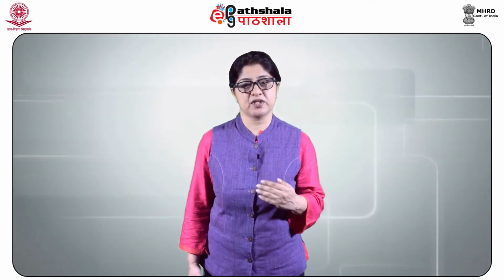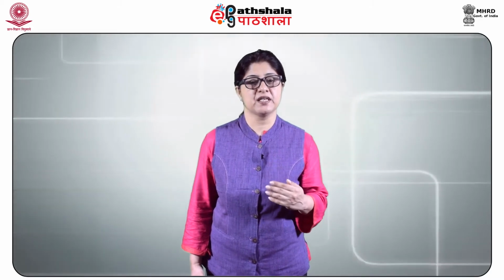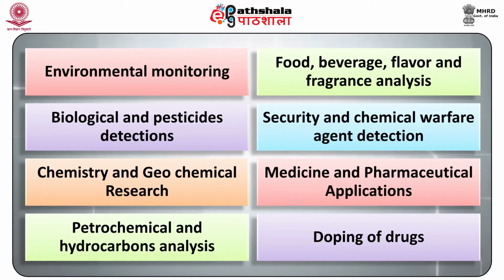It has established applications in various fields such as environmental monitoring, food, beverage, flavor and fragrance analysis, biological and pesticide detection, security and chemical warfare agent detection, chemistry and geochemical research, medicine and pharmaceutical applications, petrochemicals and hydrocarbon analysis, and doping of drugs.